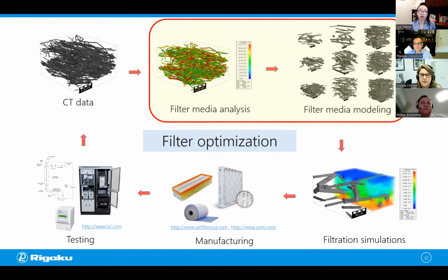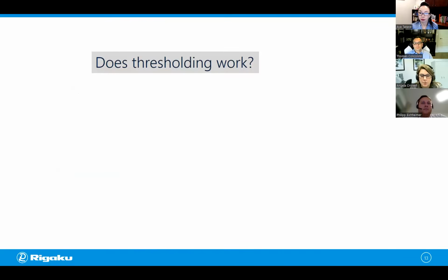All right. So the next slide I borrowed from the Digital Rock series and modified it slightly, that I already presented to you before. And I borrowed it because it has an excellent workflow for what we want to accomplish to segment our filter media. The easiest thing that we can do is to use thresholding or binarization.